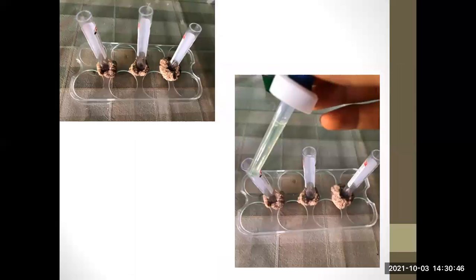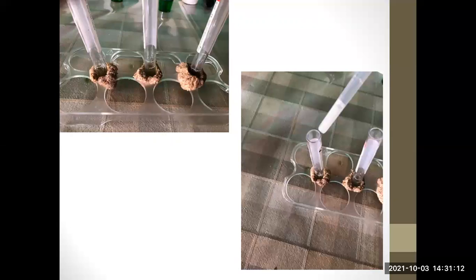Then I prepared my test tubes. I put them, as I said, on the wheat flour, standing up. Then I added 1 milliliter of the detergent peroxide solution to the 3 test tubes, which is this picture right here. I added it using this dropper, which measures exactly 1 milliliter at its fullest. So this is how it appeared after adding the peroxide solution.